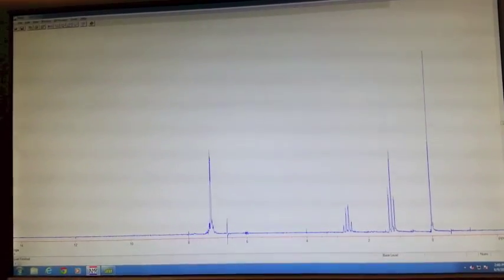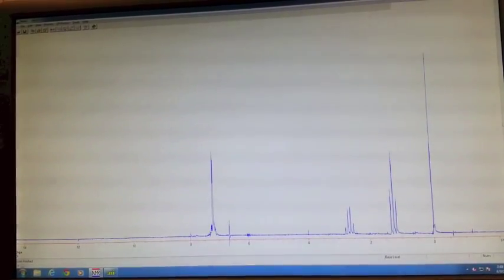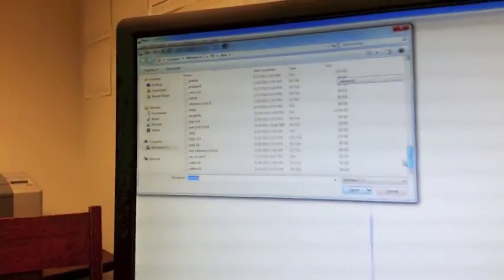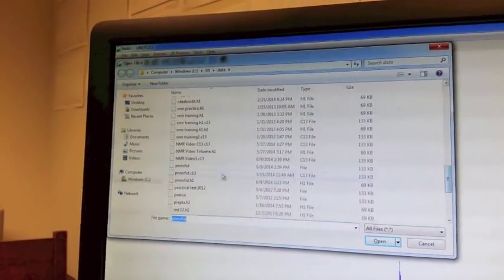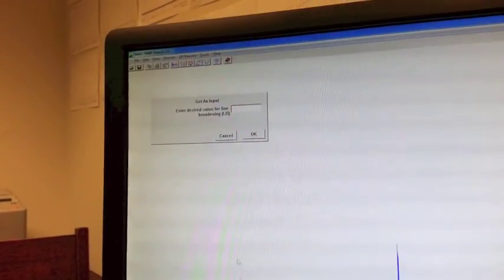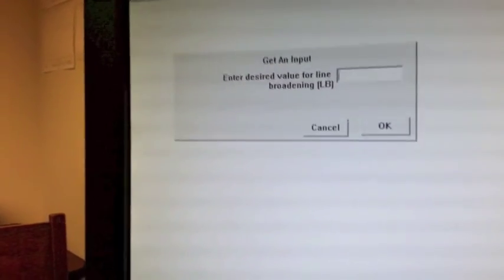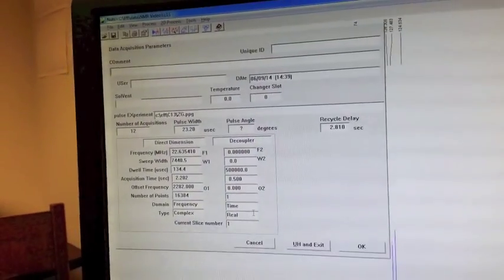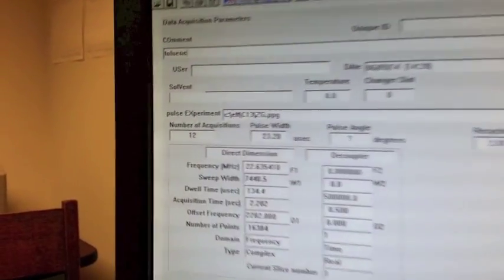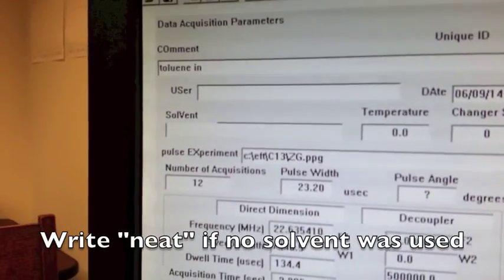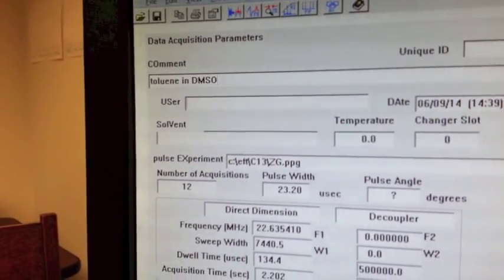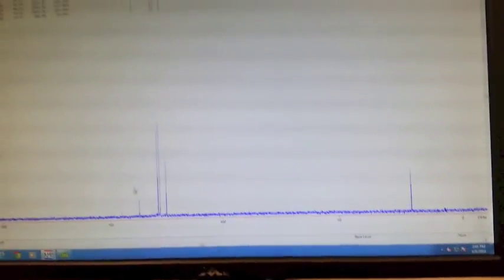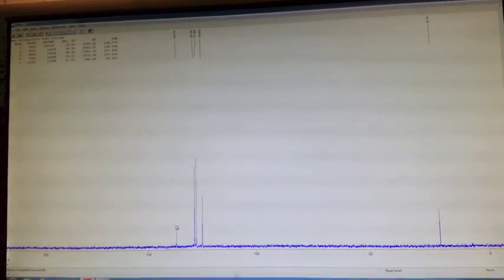The next thing you want to do is open your file. When you're taking a C13 scan, the command to do that is control F3. You want to go through the list and find your file. For the line broadening value, you want to enter 0.5. When this box pops up, you want to put what your sample is and what solvent it's in. Then in the user box, you want to put your initials. For the C13 scan, it automatically picks your peaks for you. So all you have to do now is print it out. The command to print is PL.